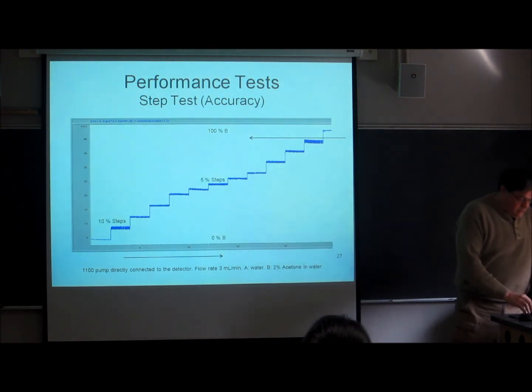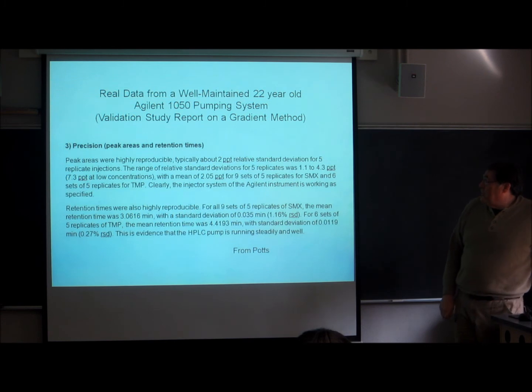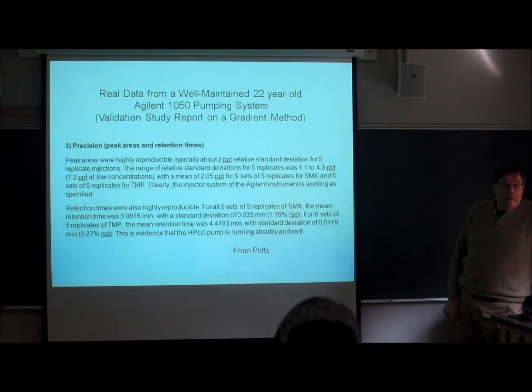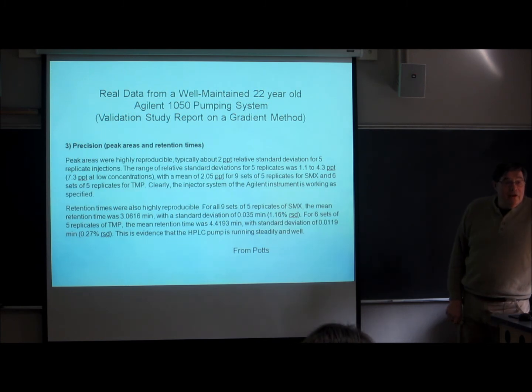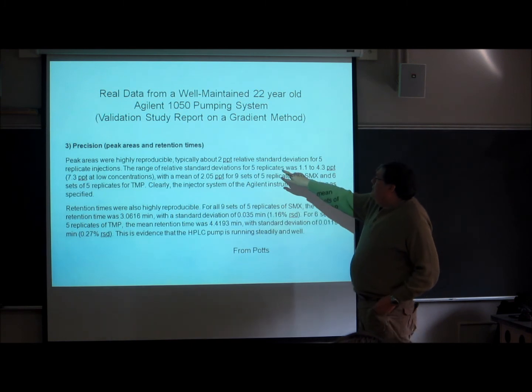We're just about out of time. We would want to measure the reproducibility of the retention time. Okay, and this is from some consulting work that I did with a company down in St. Peter that makes drug mixtures for veterinary medicine, and they have to do quality assurance tests all the time. So this is checking out the instrument. And now there's a lot of words in here.